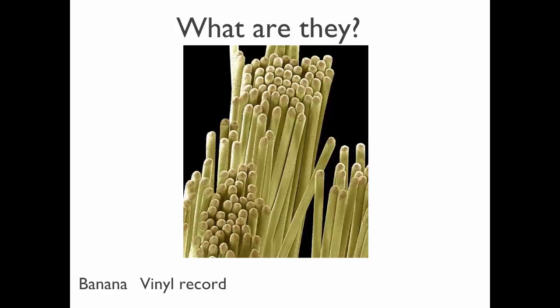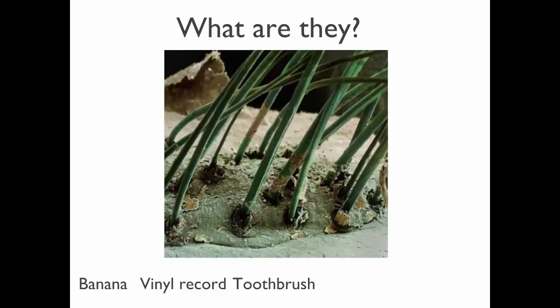Spaghetti. No? It's a toothbrush. Those are the bristles of a toothbrush. Q-tips. Oh, that. Ew. It's only for cleaning.